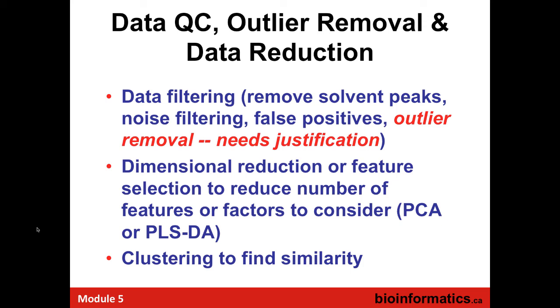And unfortunately, there are lots of people who just think removal of data is standard practice. Just take an eraser and remove the outlier, and it's gone, and that's all you need to do. But you ultimately have to explain why.